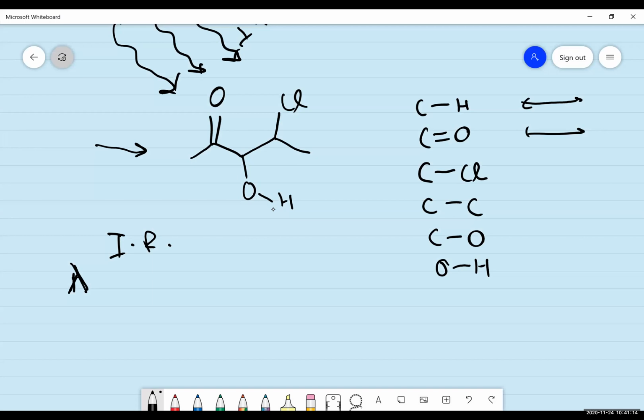So all these energy levels fall, okay, from 2.5 times 10 to the negative 6 meters to 2.5 times 10 to the negative 5. I want to give you the exact number, I had it written somewhere here. Just give me a second. Let me find exactly the number. We can calculate from here.